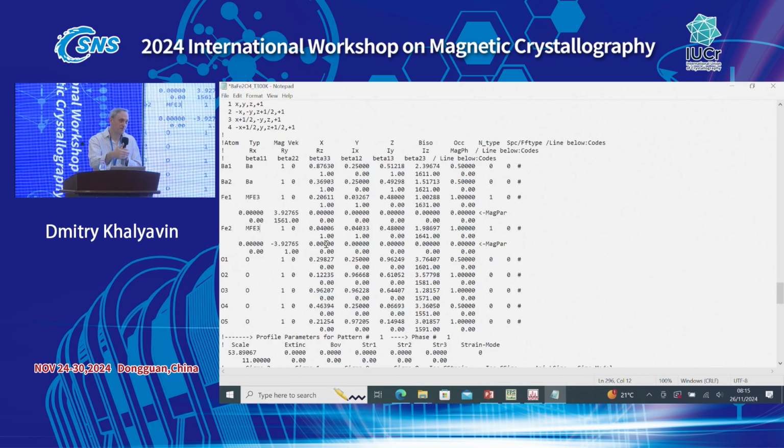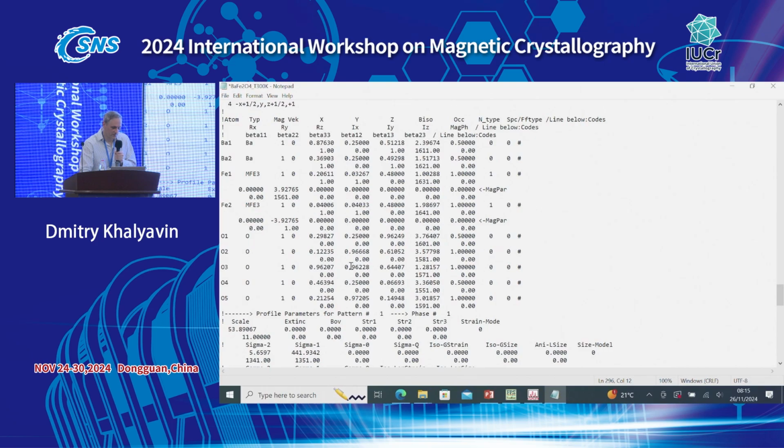Bilbao, because the MC file was generated by it, it was M2. But yeah, we can put it. The right value will be 3+. That's correct. Okay, and for oxygen, let's make oxygen also free. Let's make the refinement unconstrained. All of them. So we can decide in the PCR file, doing like that, so we have full control of what we want to refine, what we don't want to refine. So it's fully up to us. So let's refine oxygen as well.